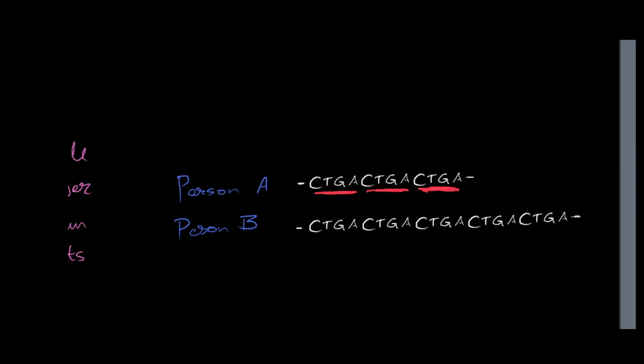And if you really think about it, then this also satisfies the requirement we just discussed, which is that it has to have a constant sequence, which is common to both. Yes, it has a constant part, and it's also variable in size, right? Because if the same part repeats multiple number of times, then this is clearly going to be larger, and this is going to be smaller, as in the fragment that contains this is going to be smaller as compared to the fragment that contains this, because of these extra repetitions.